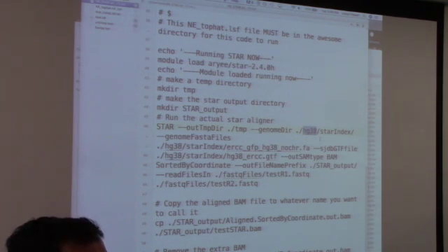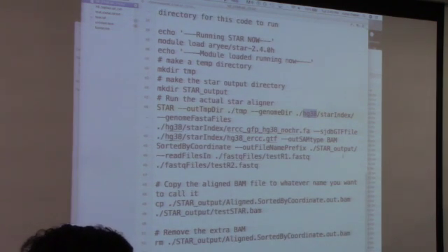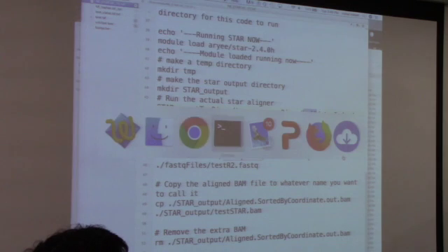And you'll send it to me, and it'll take me an hour to decode why it's failing, and all it is is that you've either spelt it wrong, or lowercase versus uppercase, another big problem. Supposing you rename it to capital STAR in some place and lowercase star somewhere else. All right, that's pretty much it.